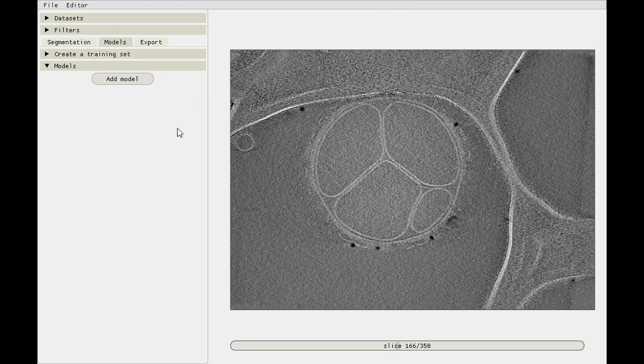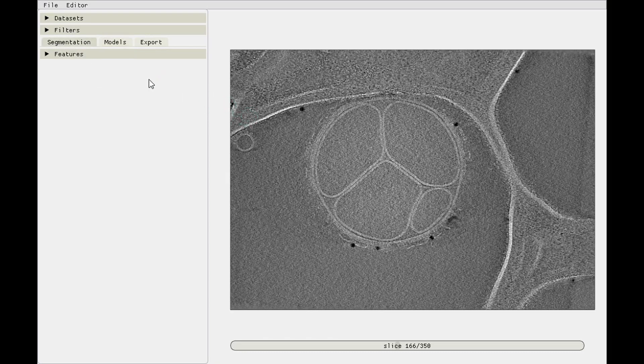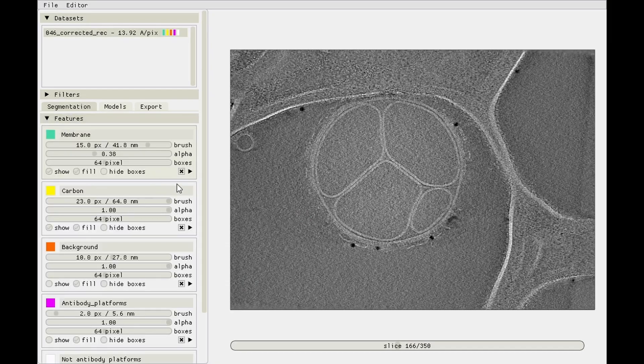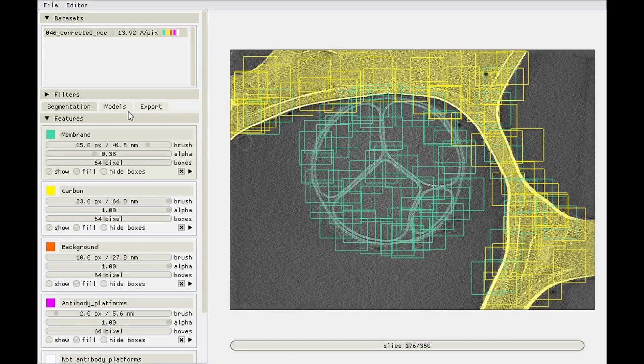The next step is to create the training datasets and train the models. I'm in the models tab right now, it's the same dataset as in the previous video, as you can see by going back to segmentation and then actually finding one that we annotated. Same dataset.